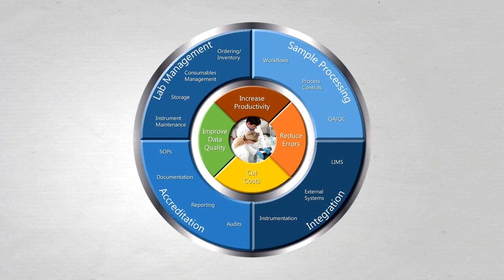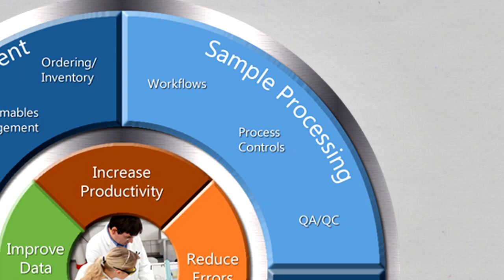STaCS DNA software helps you to manage 4 critical areas of your lab. This video focuses on sample processing at the bench, which covers DNA-specific workflows, preventative process controls, and quality assurance and quality controls. Let's talk about each one of these areas.